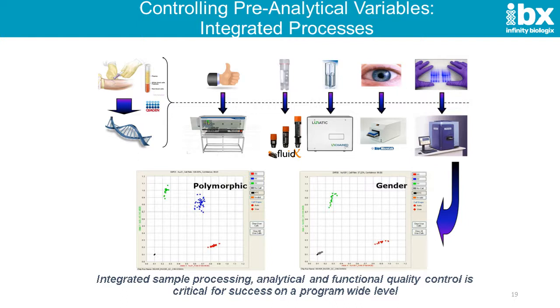So let's just assume for a second everyone coordinates around a single technology for nucleic acid extraction. Above the dotted line is what a typical lab may do. There's manual processing. The vials or the storage vessels that are chosen may not be automation friendly. A lot of sample is used to make some blunt measurements. We make eyeball measurements when it comes to volume. And then for QC, we use rather blunt tools for looking at whether or not nucleic acid is of quality enough for analysis.